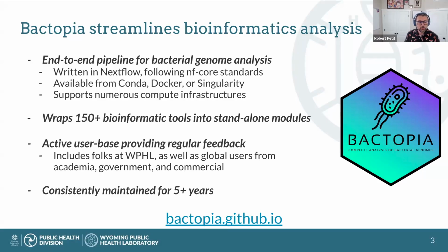It wraps more than 150 bioinformatic tools into standalone modules, which are kind of cool because you can shuffle those around like Lego pieces. And it has an active user base that's providing regular feedback. This includes the folks here at Wyoming. We use it on a regular basis and we are always adapting it to our needs, but as well as global users from academia, government, and commercial entities.